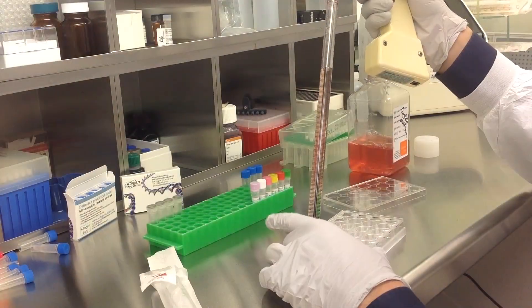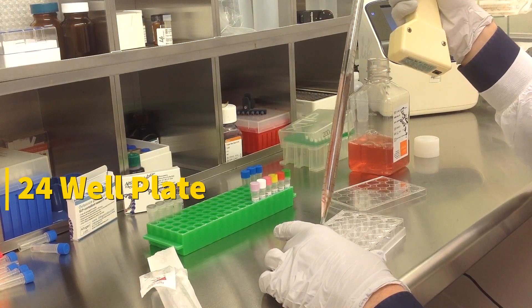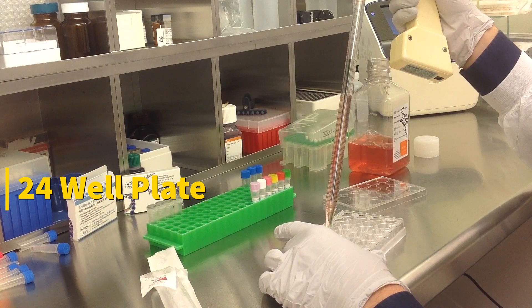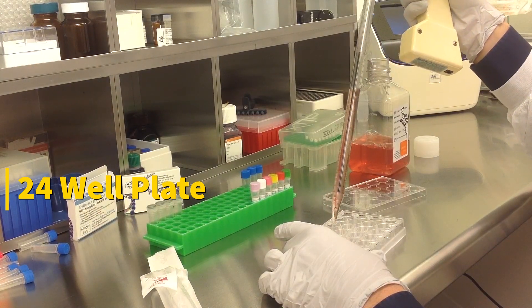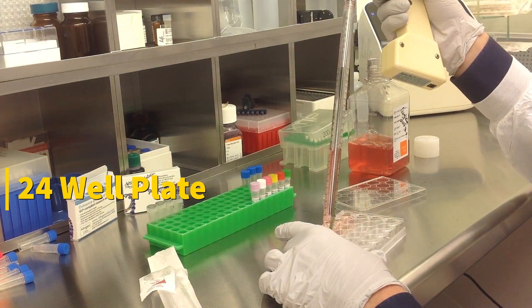Today we will be transfecting HCT116 cells obtained from ATCC, using a transfection kit manufactured by Altogen Biosystems. In this tutorial, we use a 24-well plate. Transfections can be scaled up or down based on plate surface area as described in the corresponding transfection protocol, which can be found at altogen.com.